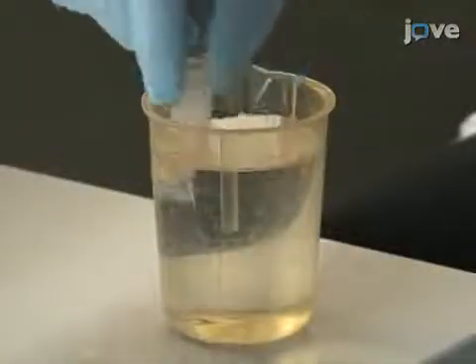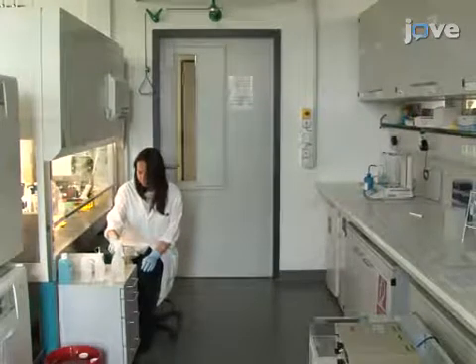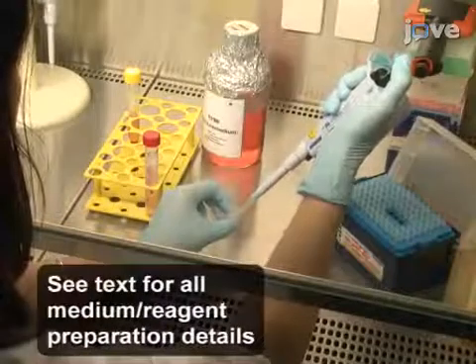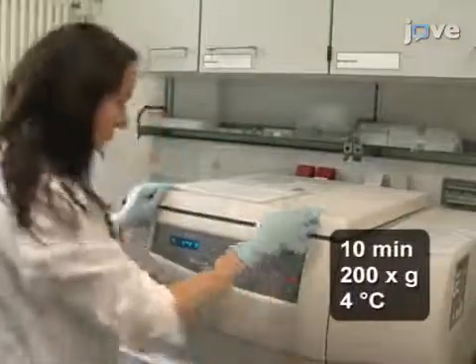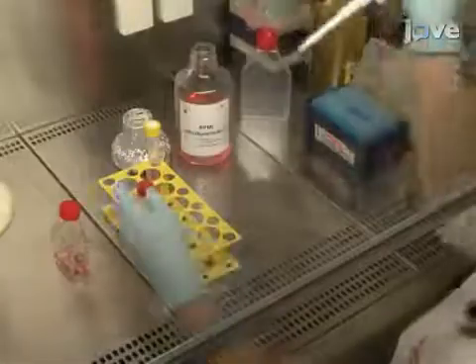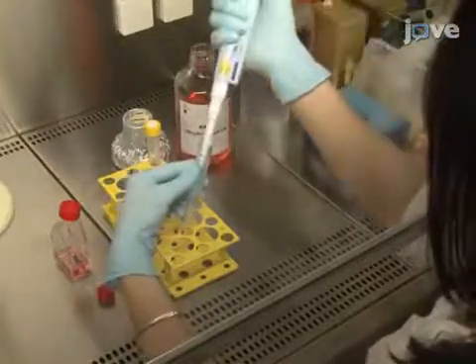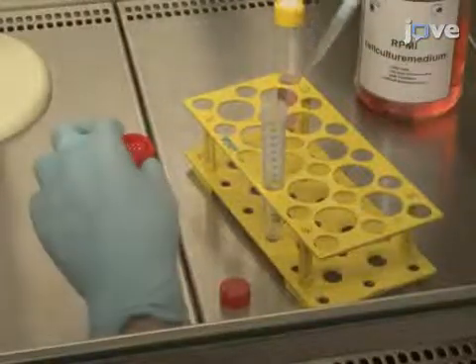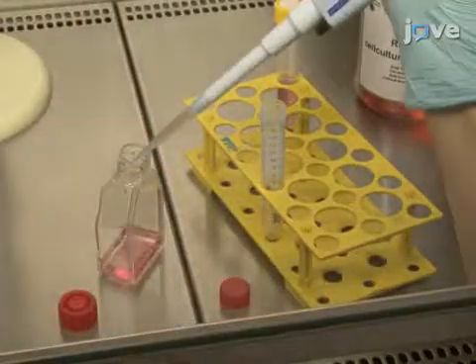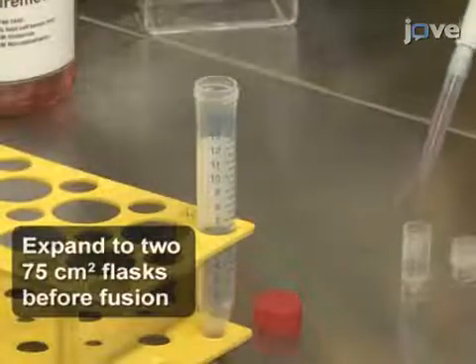To prepare the myeloma cells, thaw a vial of murine SP2/0 cells in warm water. Then transfer the cells into 10 milliliters of culture medium and collect them by centrifugation. Re-suspend the pellet in 10 milliliters of fresh culture medium and seed the cells into a 25 square centimeter flask for incubation at 37 degrees Celsius and 5% CO2. Preserve aliquots of the cells for long-term storage after the appropriate number of expansions.